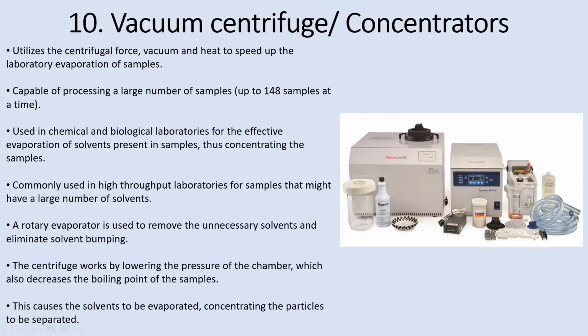Sometimes after certain processing, after the crude extract, you might have to subject it to some other treatment depending upon what you are working on. Now, after you do that sort of treatment, probably you are adding some solvent to it. You do not want that solvent to stay in the biomolecule. It was only used for separation, only used for the isolation. Now, how do you get rid of that particular solvent? It may be ethanol, it may be isopropyl alcohol, it may be any other solvent.